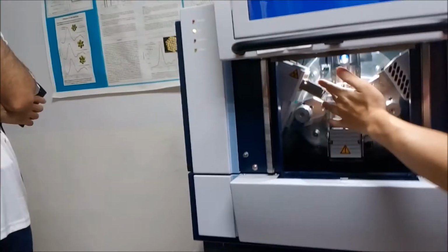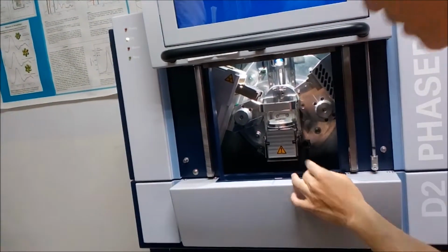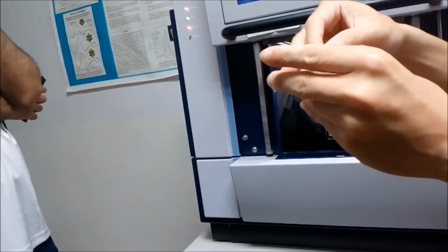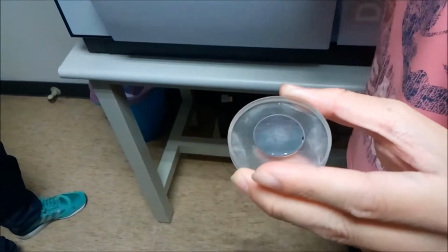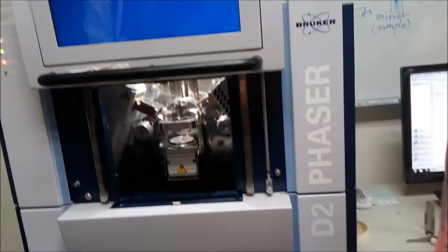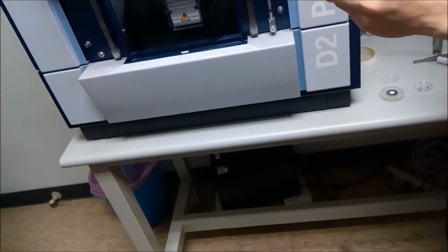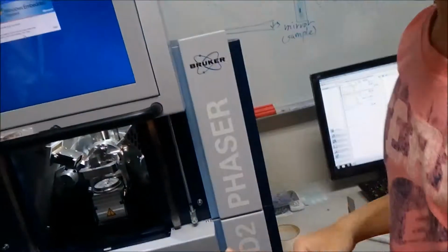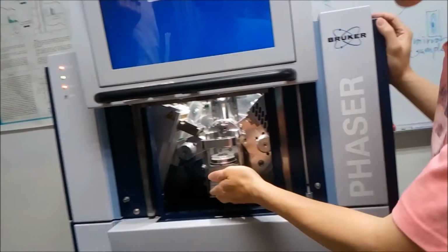And let me test the silicon dioxide. Because we know the X-ray beam is just 0.2 millimeter, it's very small, all we need to do is put the sample in the center. If your center has your sample, it's okay. And make the sample very flat. If the sample is not flat, the peak will be broad, because it's just like a mirror. If the mirror is not flat, your peak will be broad. So make sure your sample is flat and in the center, and that is okay.